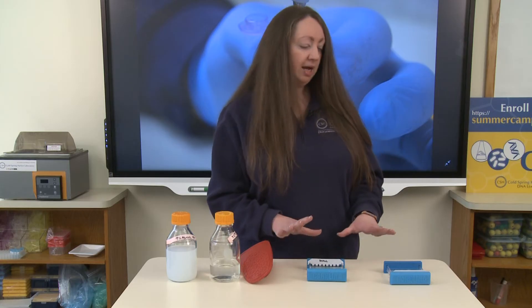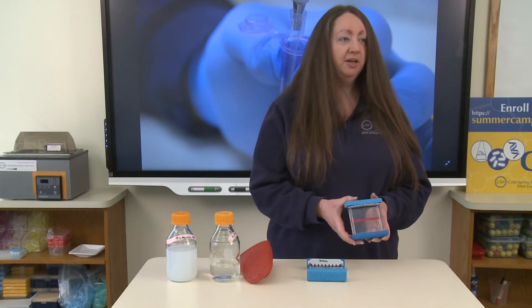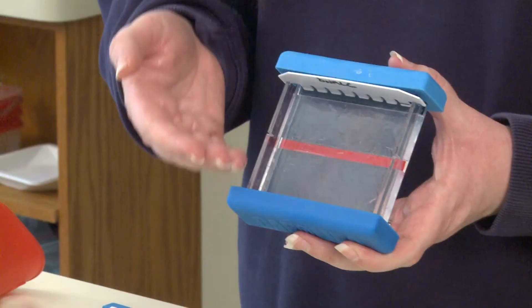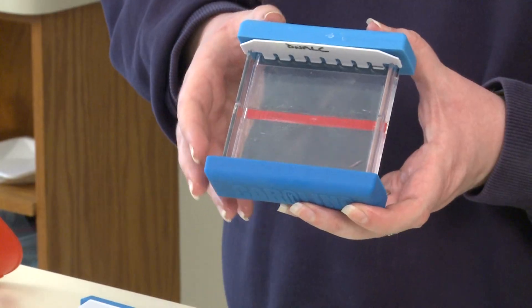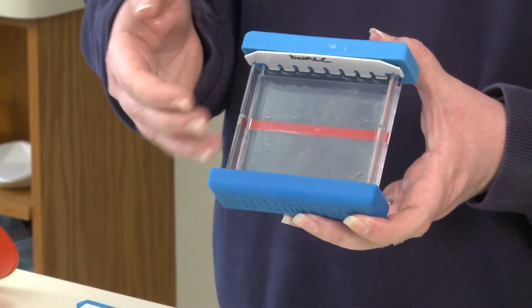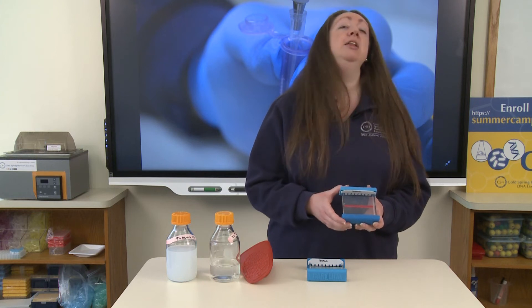While that's setting, I have an agarose gel that is already set up that we can see here. You can see that the agarose inside of the casting tray has solidified and has changed color just a little bit — it's a little bit foggy now. That's a pretty good indication that the gel is now solidified enough for us to be able to load our samples.